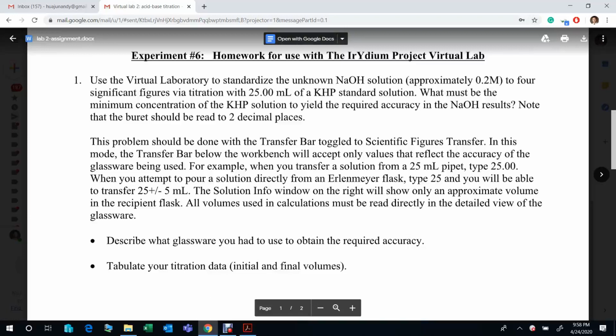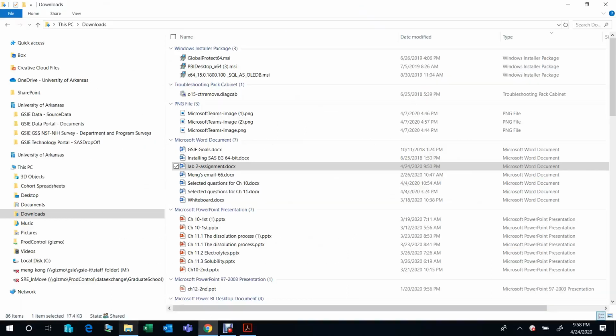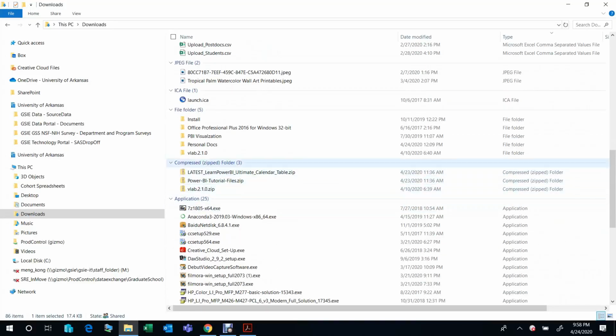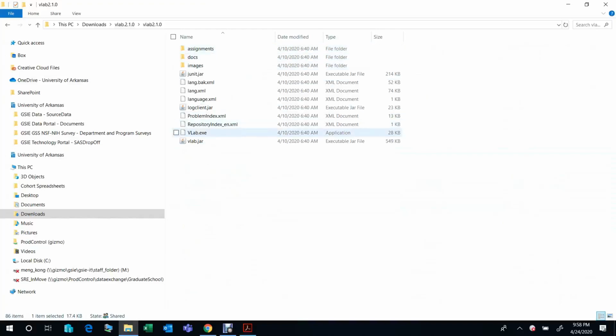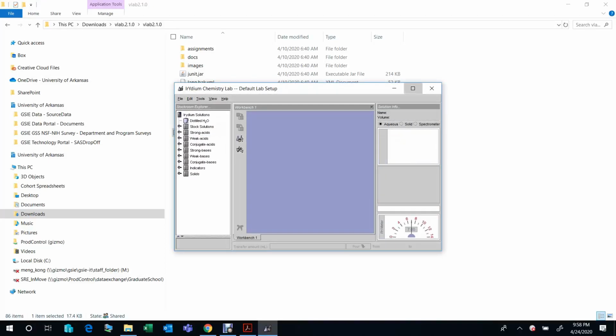Well, you can read this, and this information is very important. And then in the following, I will show you how to do the experiment, the virtual lab. So first we go to find this offline software, and then we click application. Okay, and now we're entering.